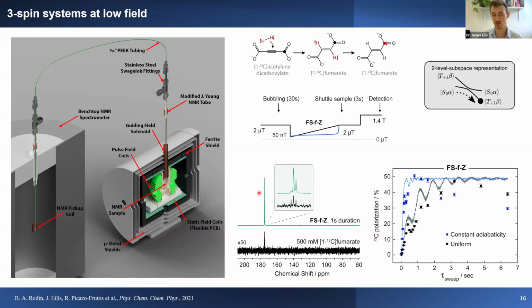Our signal to noise is very large, so in these sort of experiments, we don't typically do signal averaging. If I understand the question properly, building this sort of apparatus can take some time, some days or weeks. But the experiments themselves are relatively fast. Having said that, if you're collecting all of these data points individually, well, that becomes quite time consuming.